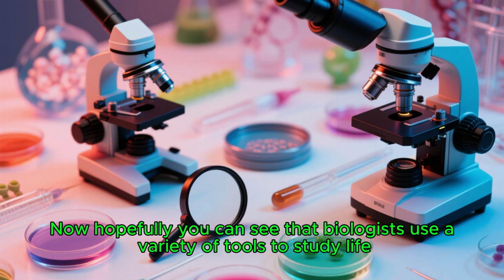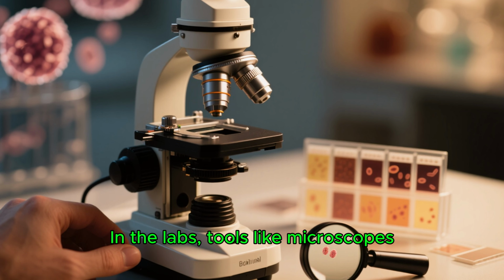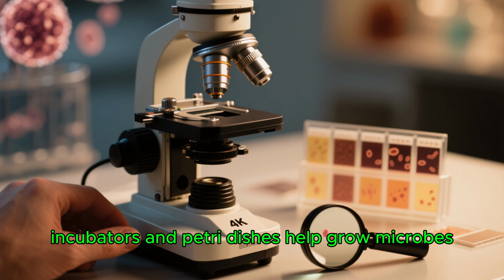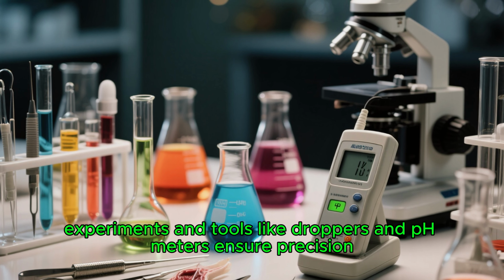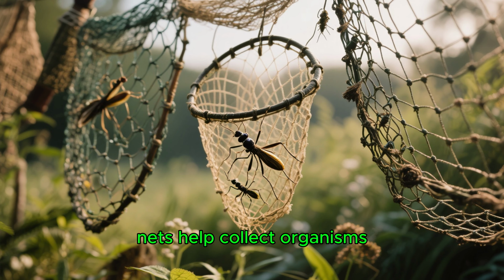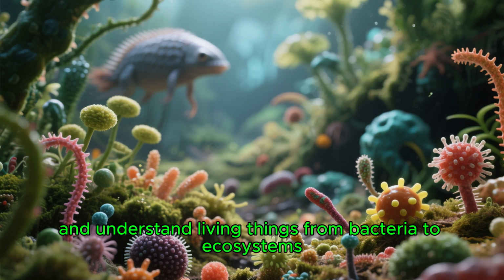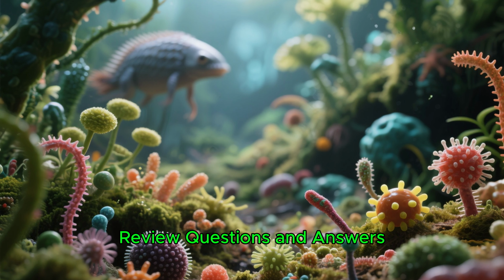Now, hopefully, you can see that biologists use a variety of tools to study life. In the labs, tools like microscopes, hand lenses, and slides help see tiny cells, while autoclaves, incubators, and petri dishes help grow microbes. Dissecting kits, beakers, and burners aid experiments, and tools like droppers and pH meters ensure precision. In the field, nets help collect organisms. These tools enable biologists to observe, test, and understand living things from bacteria to ecosystems, leading to discoveries that improve our knowledge of life. Review questions and answers.